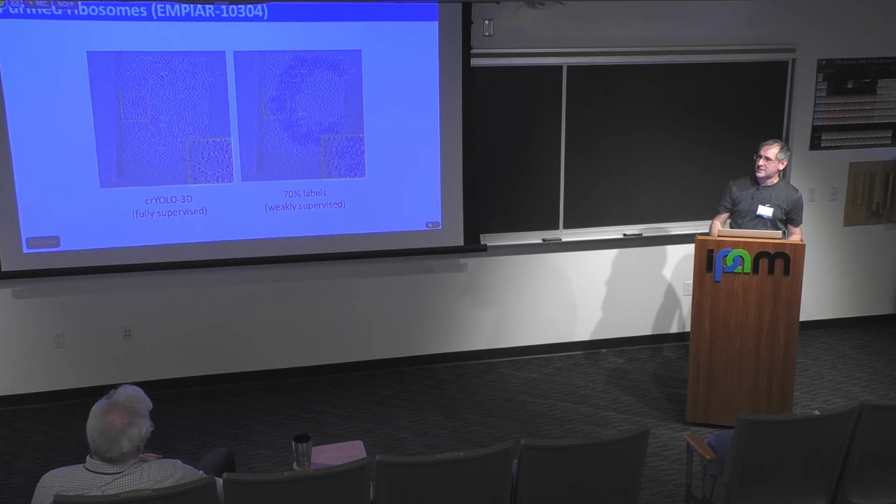Then this is a single particle type of sample, right? Your particles are uniform, and it's a monodispersed sample. That makes it easier. In the real scenario, like the image I showed at the beginning, everything is going to be very crowded, so it's going to be very difficult to even annotate those images, right?